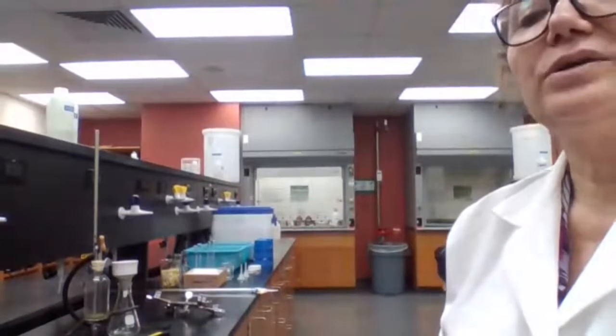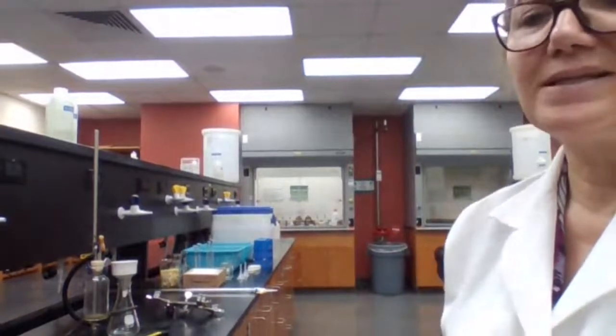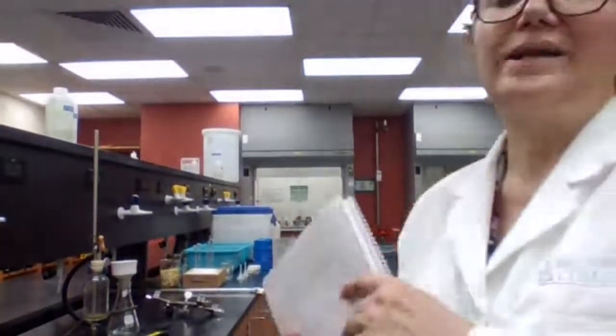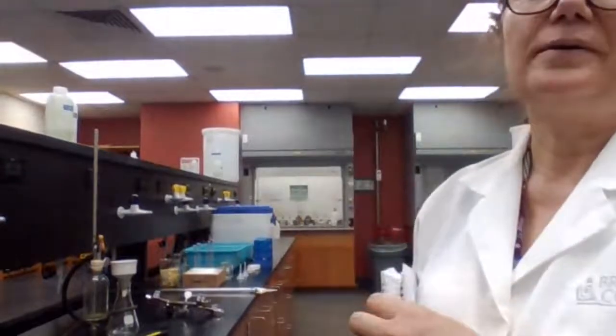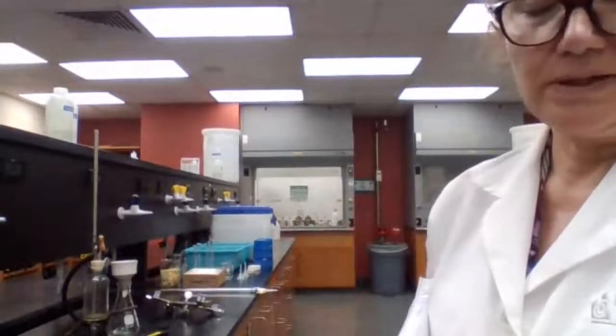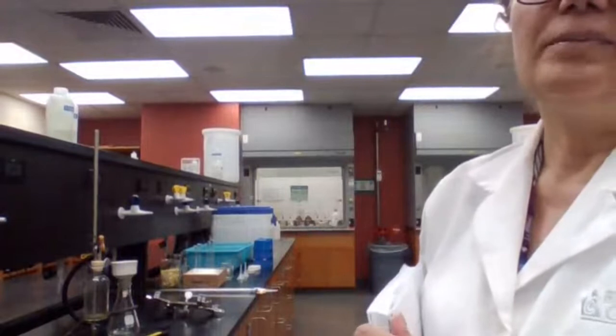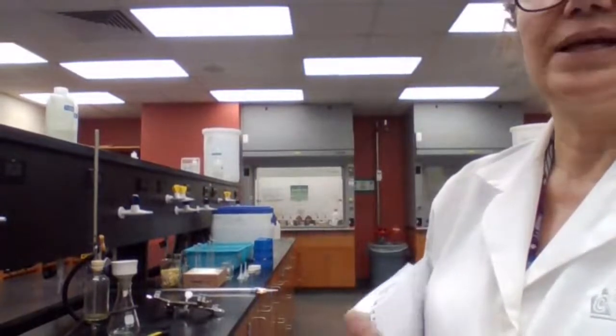Titration is going to replace the derivatization for carboxylic acid. If you have aldehyde or ketone, you have to do derivatization. But for carboxylic acid, you could only do titration, and then you find the equivalence point. You are using indicator to find the equivalence point, and then based on the equivalence point, you can calculate the molar mass. 3 steps on page 221.